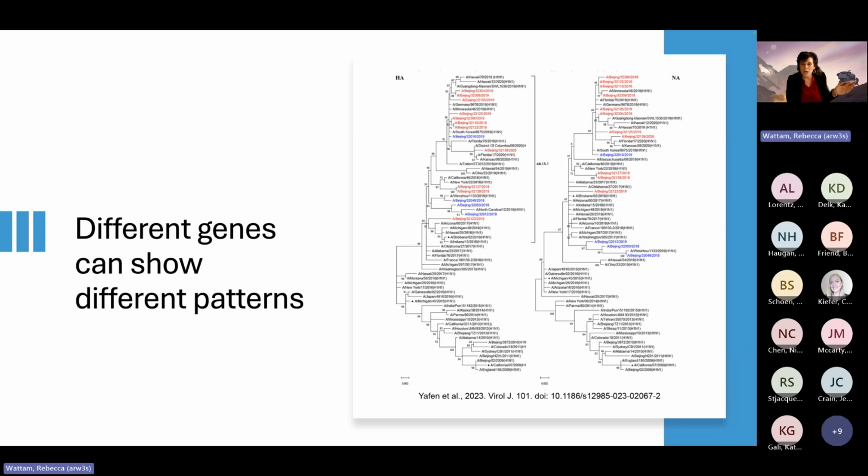If you were doing a broad scale examination, you wouldn't want to use HA for one organism and NA for another because, first of all, the alignment would be terrible, and the things wouldn't match up very well. So you have to pay attention and think about what it's telling you. And if you're doing it yourself, I would recommend being consistent as you go along.